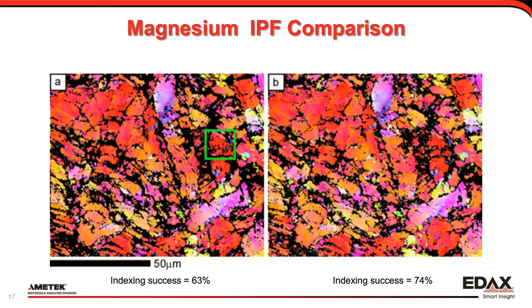Magnesium samples are notorious for giving very low quality patterns and maps even at the best polishing conditions — you usually don't get really great patterns like you do with steel or nickel transition metal samples. In this case, the raw data is only 63% indexing. NPAR increases that up to 74% — an increase of about 10% in quality. It still does not get you approaching 100%, but it makes it better and may help a little more with interpretation. NPAR isn't the be-all end-all, but it does help in getting better maps and better data for interpretation.